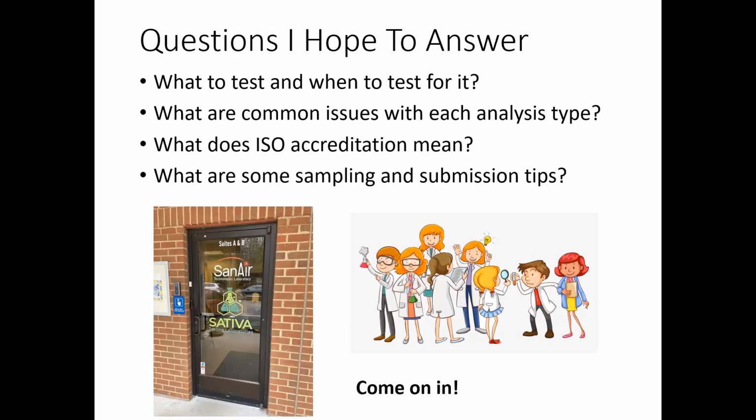Dr. Pike mentioned our ISO accreditation. I wanted to be very straight about what that means because it doesn't always mean what people think. And then just have a slide on some general sampling and submission tips.